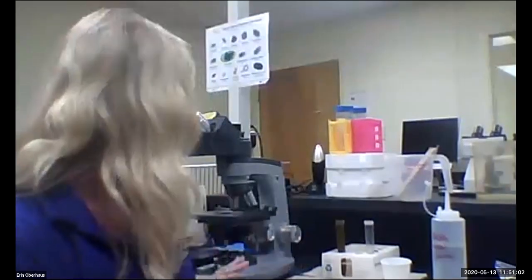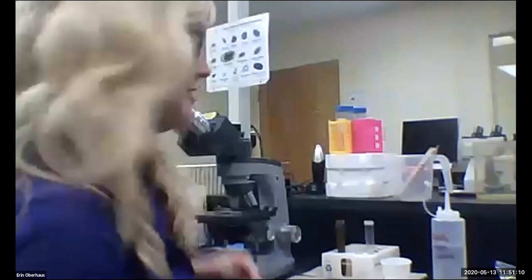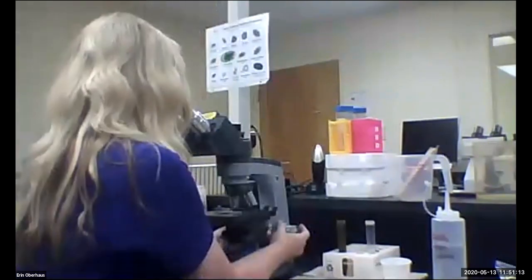Dr. Oberhaus, do you have anything else that you'd like to add? No, I was going to, let's see, I put the cover slip on the slide. The scientist in me wants to see what's there, so I have to. And actually, I set one up this morning. I went out into the pasture and found a few fresh piles and grabbed some, so I don't know which horse they actually came from.